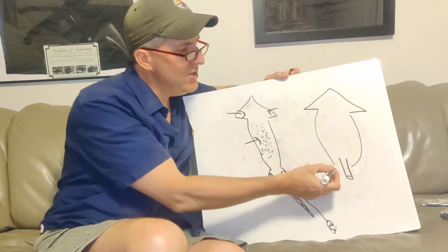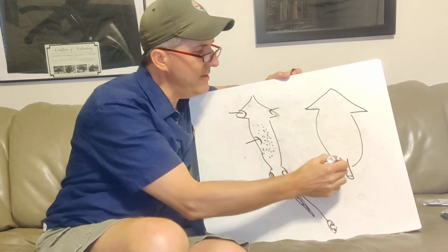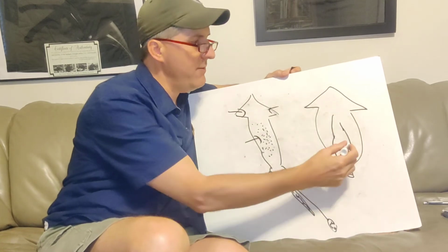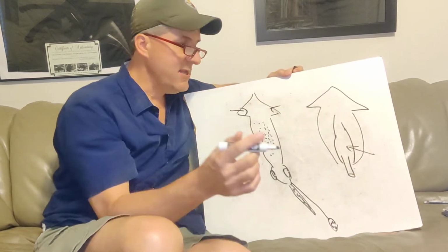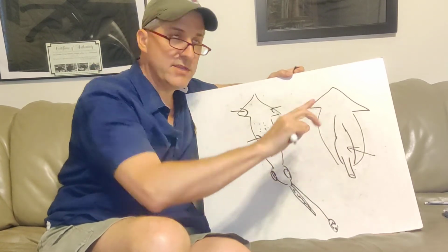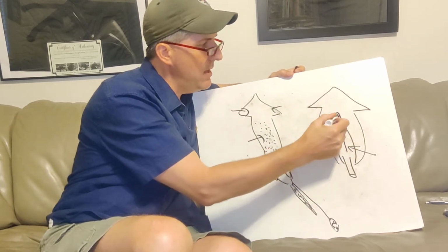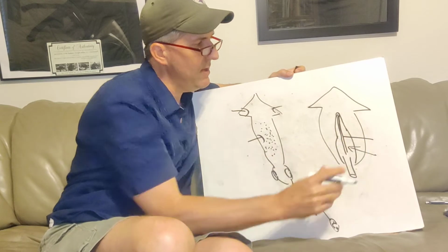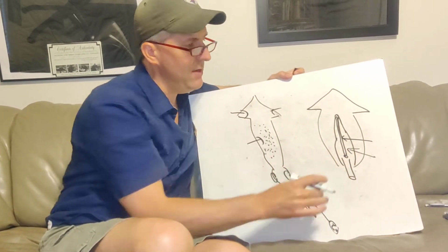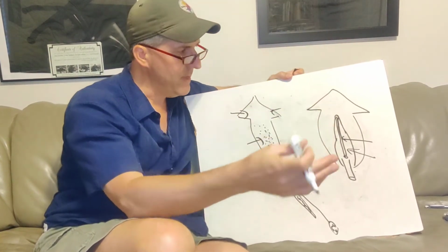What you then do is take your scissors and you slit up both sides and peel it up. What you would see when you did that, there'd be a large muscular pouch all the way down further away from you. That's the stomach. The stomach, like the clam, is going to come up, and then it's going to make a U. It's going to come back down the other side. So it makes a U-turn. So the stomach comes all the way up, and then it comes back down. That's the intestines then. Okay? The intestines is then going to empty from the anus in the ex-current siphon, so when the water pushes out, you defecate, and it goes out with it.